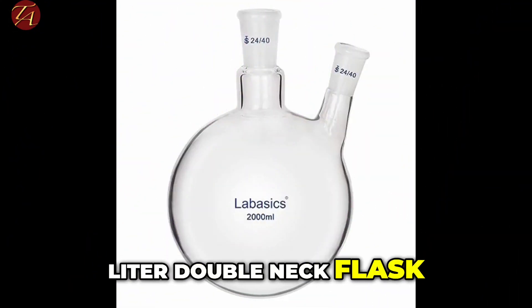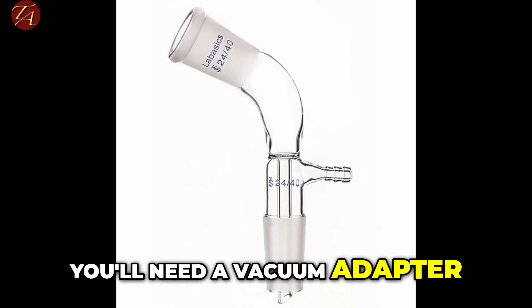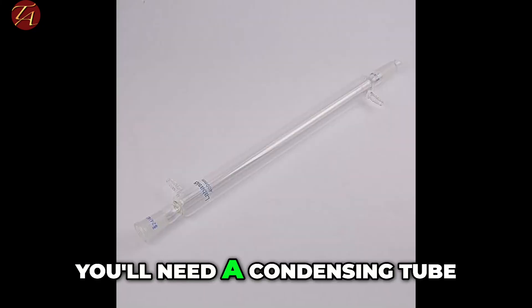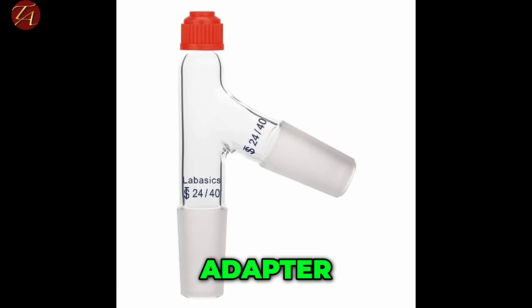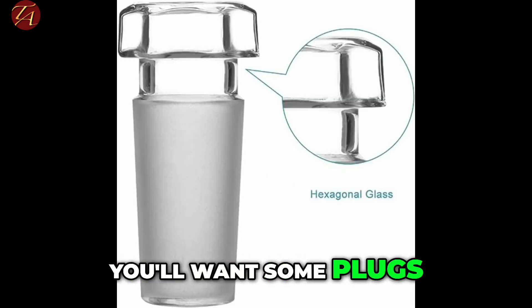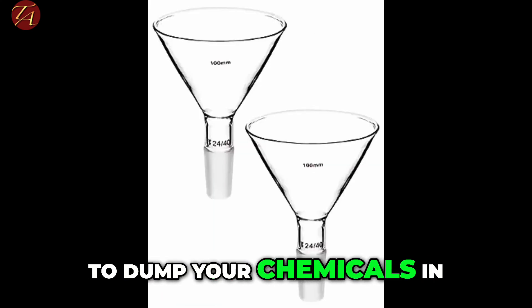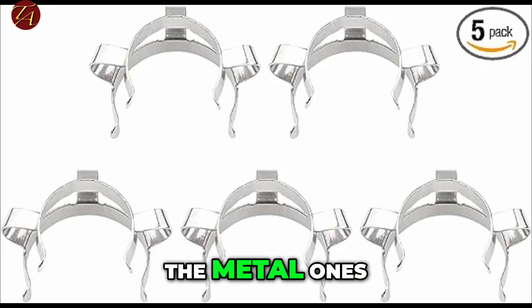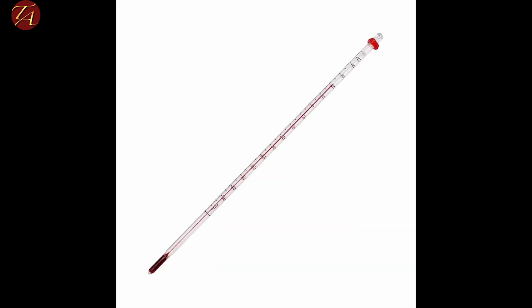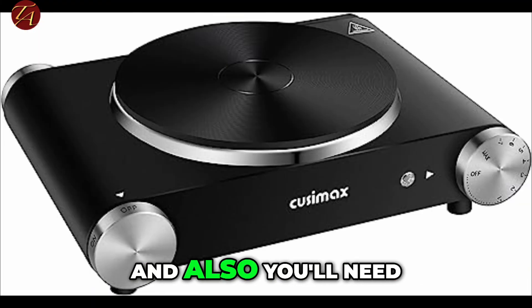You'll want a two-liter double neck flask — that's big enough that you won't have boil-overs. You'll need a vacuum adapter, a condensing tube — I suggest the 400 millimeter, that's big enough — and also a thermometer adapter. You'll want some plugs for the two-liter flask, some funnels to pour your chemicals in, and some stirring tubes. Get metal keg clips, not plastic — the plastic ones break pretty easily. And get a good thermometer positioned down around the neck, plus a good hot plate.